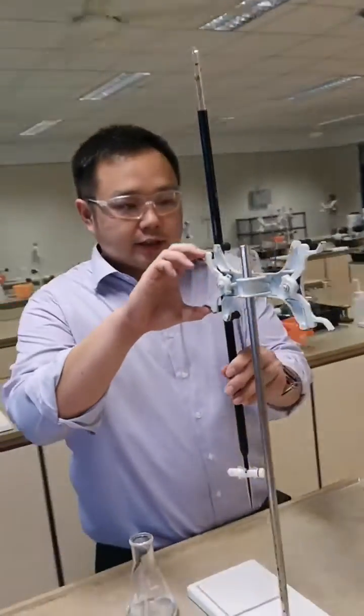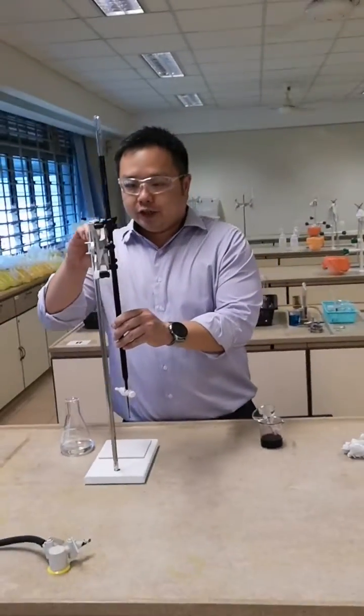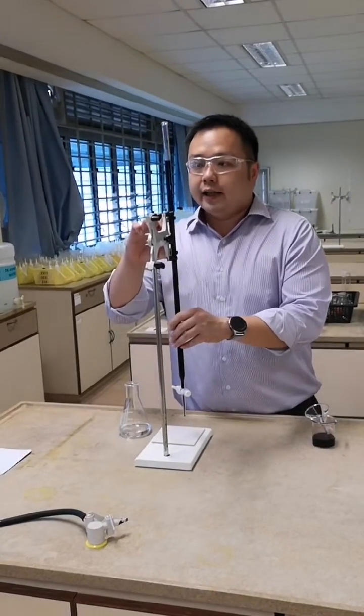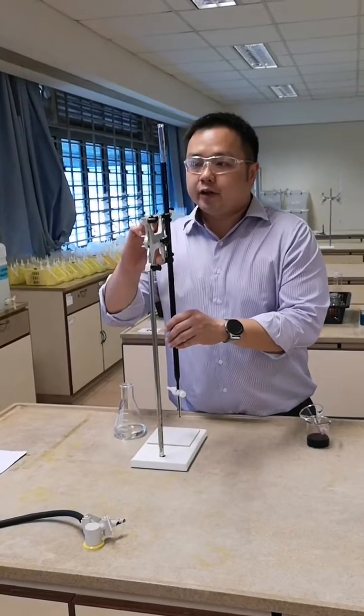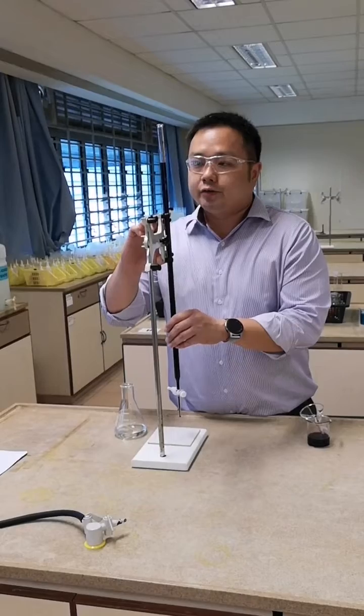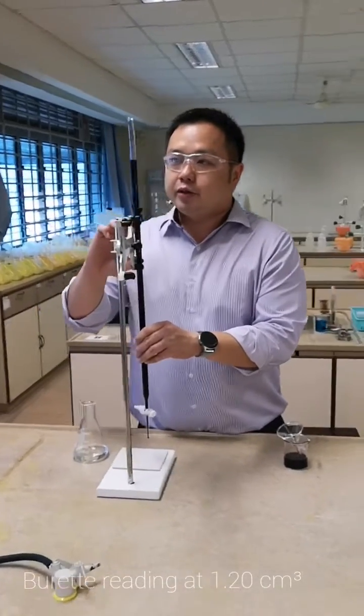Before you start the titration, it is good to check and read the burette at eye level so as to prevent any parallax error. The reading over here reads 1.20 cm³.